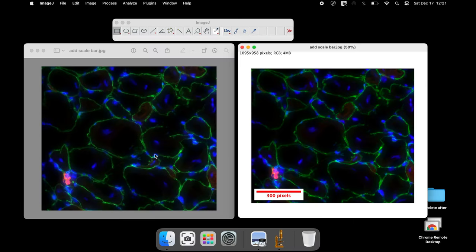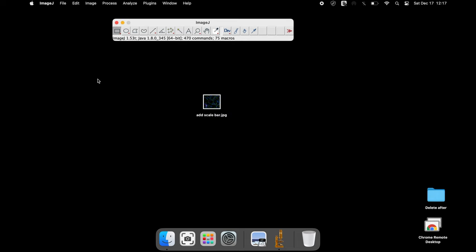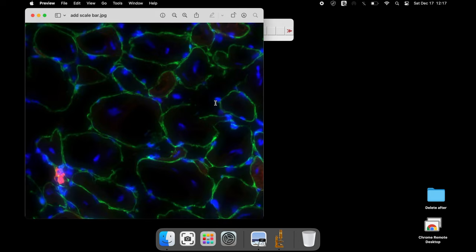This tutorial is about how to add a scale bar to an image using ImageJ software. Here is a confocal image with three different channels: green, red, and blue. Currently there is no scale bar in this image. Let us use the ImageJ software to add a scale bar.